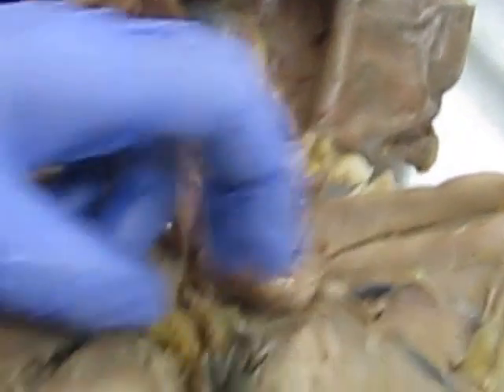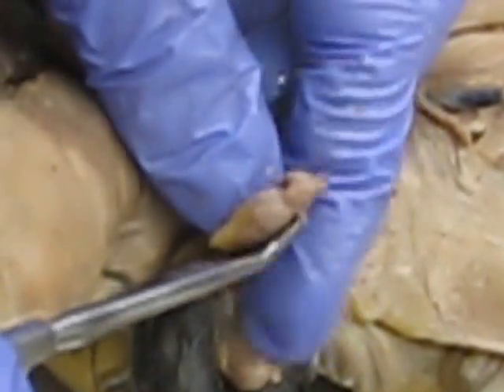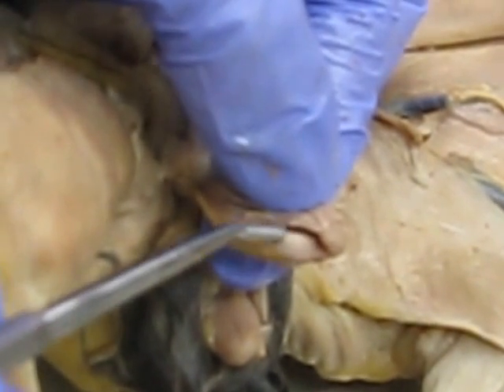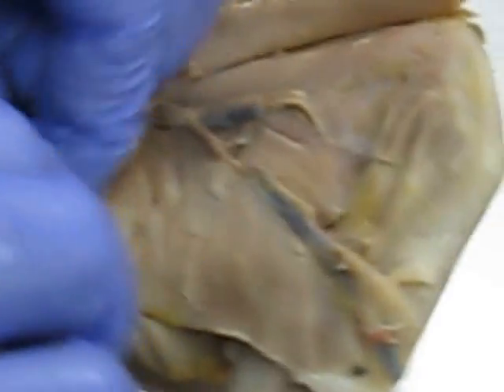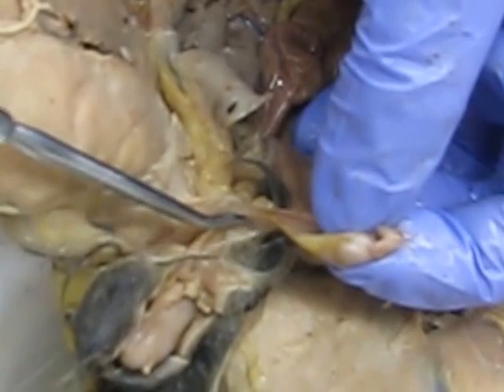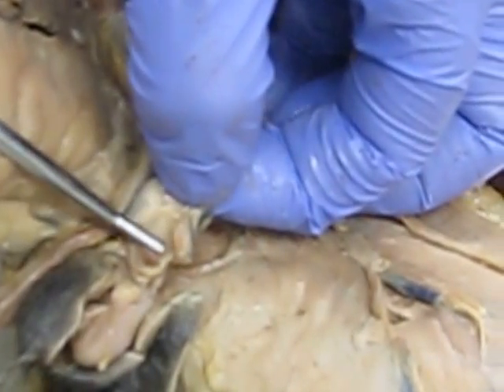If we look at the male reproductive system, we have the testes. We remove the tunica albuginea, and we can see the epididymis. So the testes would produce sperm in the seminiferous tubules. It would move into the epididymis, into the vas deferens, which with the vessels makes up the spermatic cord. So this cord right here leading away is going to be the spermatic cord. And then the penis is located here.